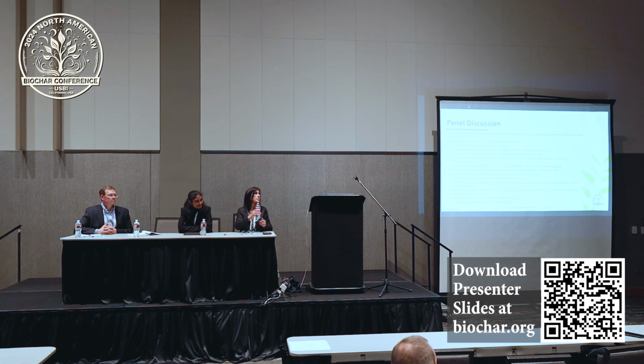A quick comment on the H to C. The way that we go about getting consistent results for that ratio is heavily on the pre-processing. We chip it up, and then it goes through a drying process on its own until it gets to our desired dryness.